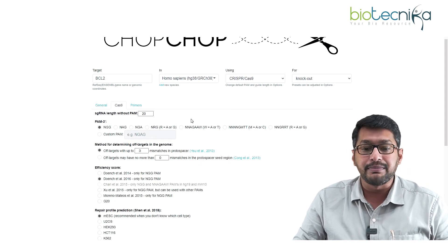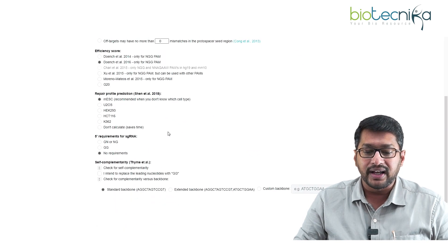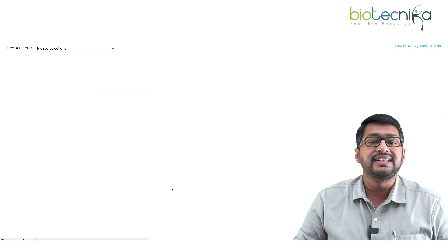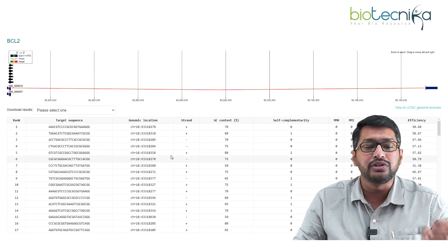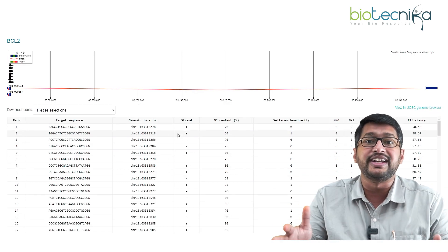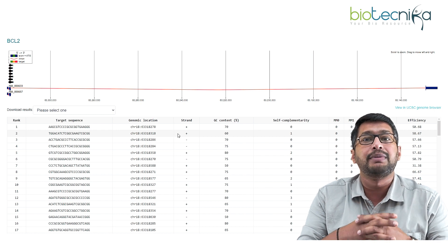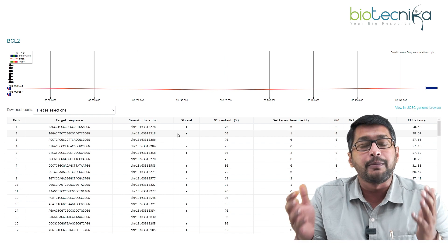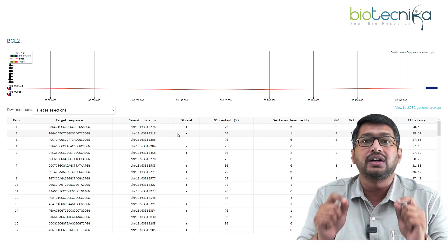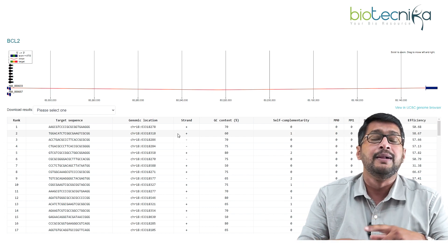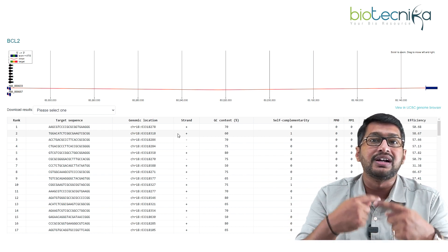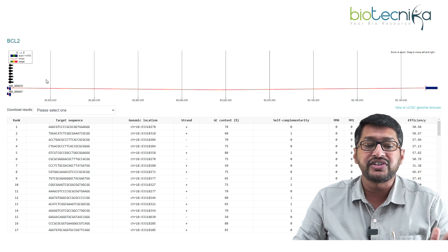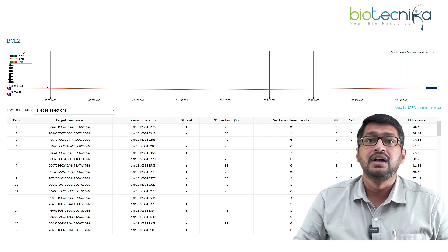I'm running on default mode, so I click 'Find Target Sites' at the bottom. This will take a few seconds to minutes. If you are not in a queue, results appear immediately; otherwise you may wait 10–60 seconds. Please do not click multiple times, as each click reruns the entire process.